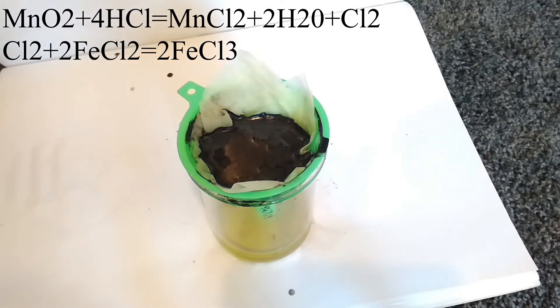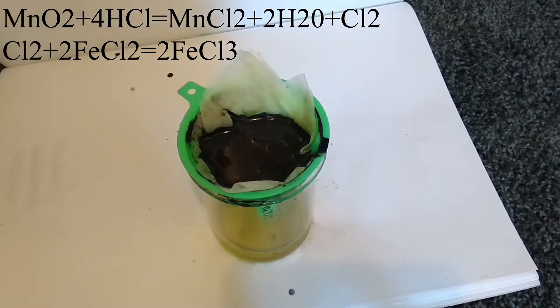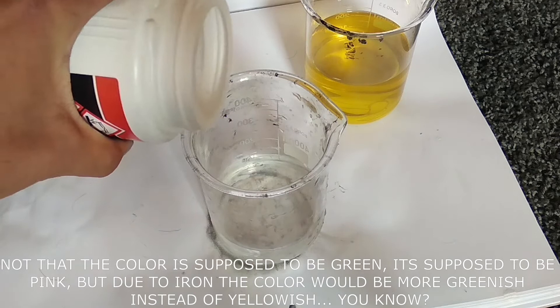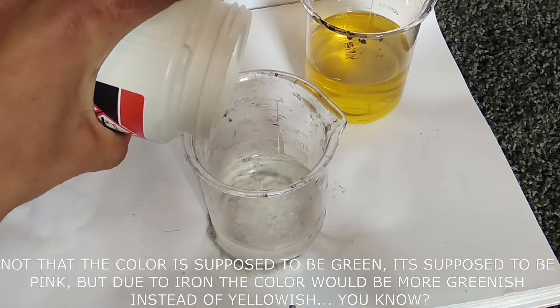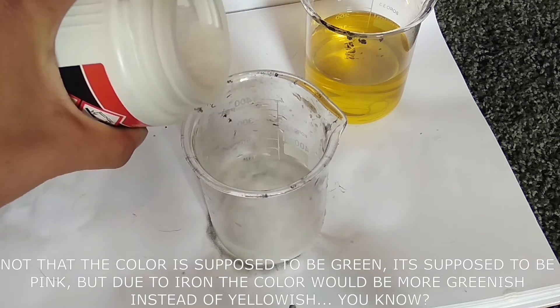The reason why it's yellow is because of the iron 3 ions, where the chlorine gas produced by the manganese dioxide reacting with hydrochloric acid is actually oxidizing the iron 2+ ions into their iron 3+ state, which changes the solution from green to yellow or orange.